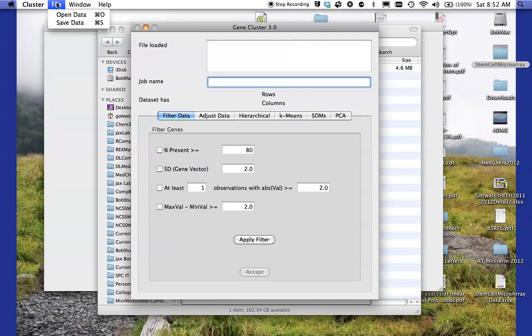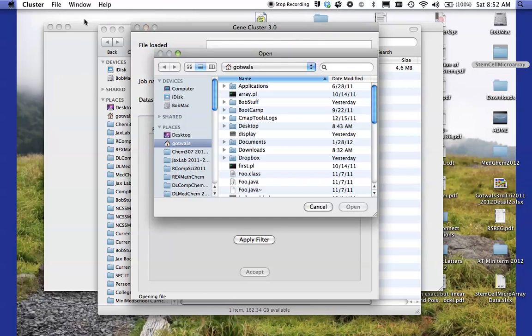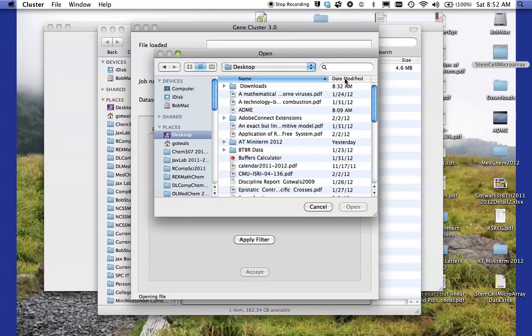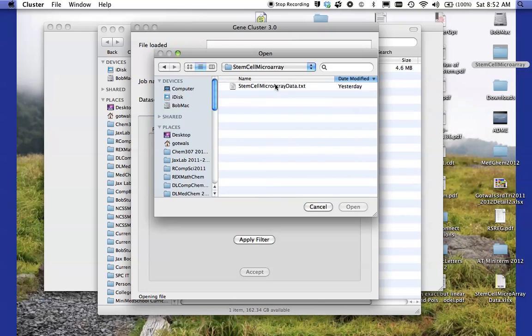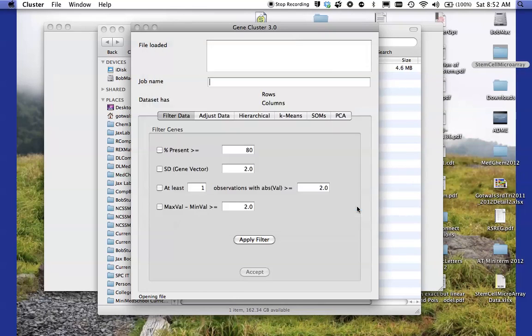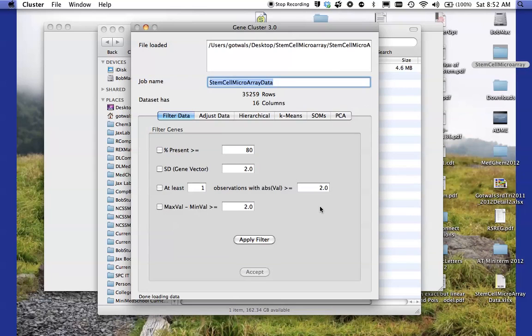So cluster has been opened and it should look like this screen. I'm going to go up under file and say open data, go to wherever my folder is. There it is. And open up stem cell microarray data dot text and I'm going to say open that file and it now tells me that the file has been loaded and it gives the job a name.